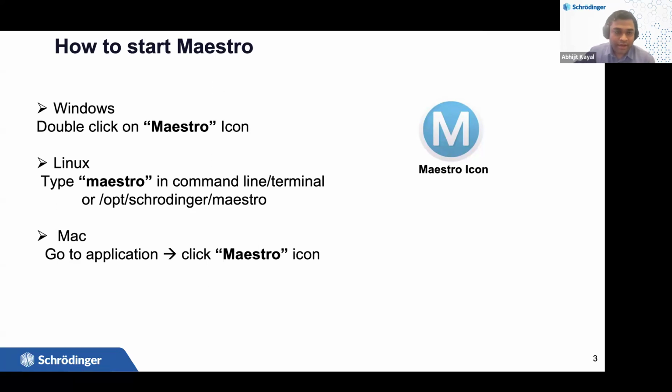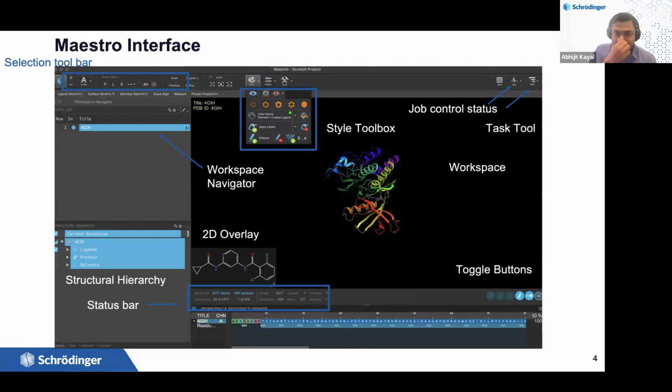Okay. Or if you are using Mac, then you just need to click the Maestro icon there. Okay. So now I'll go to the next step. When you open this Maestro interface, you will see this kind of graphical user interface here, and I'll explain it one by one.